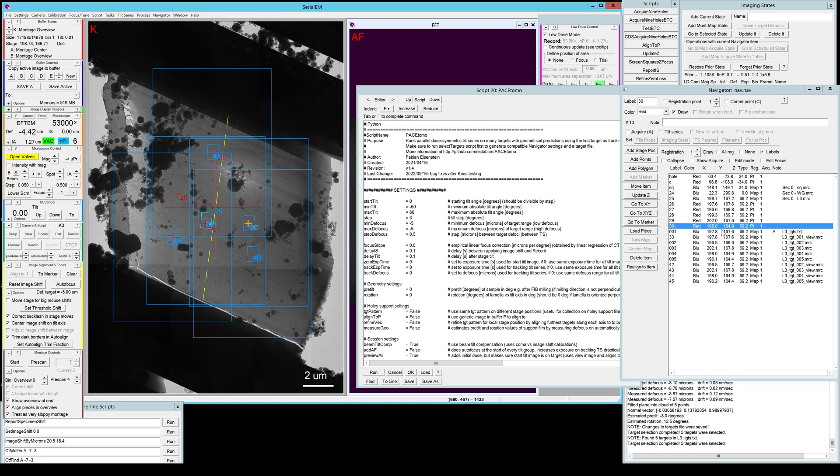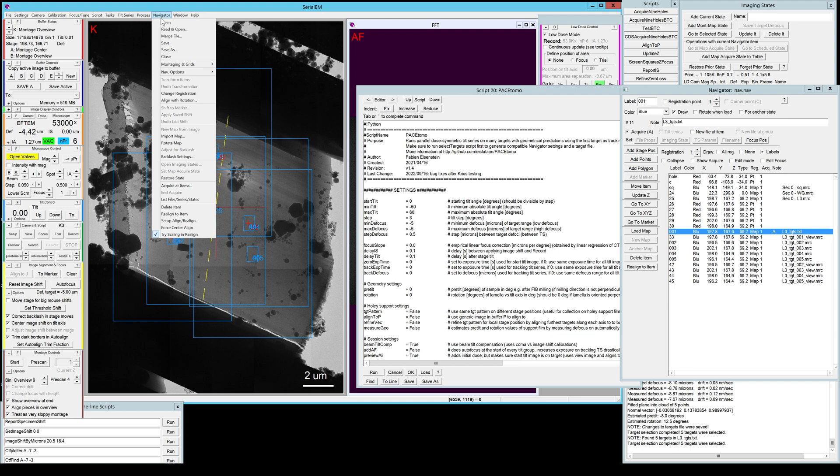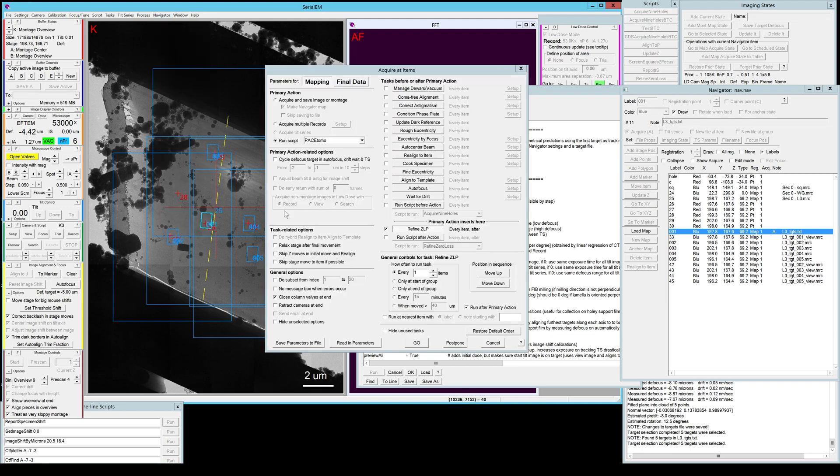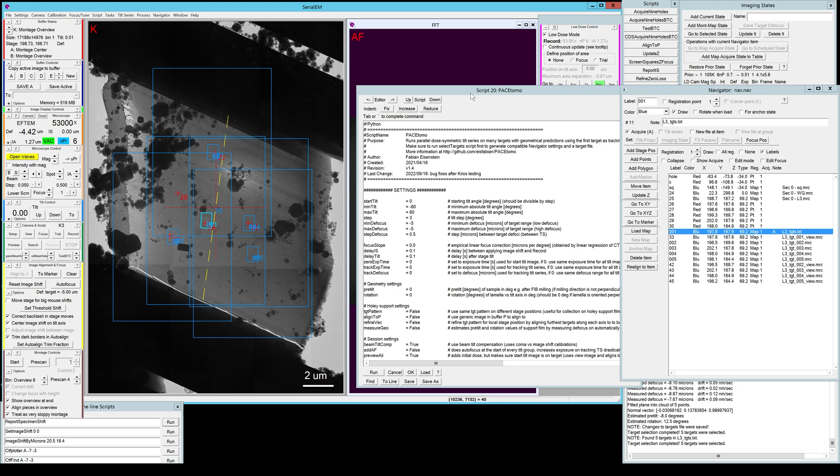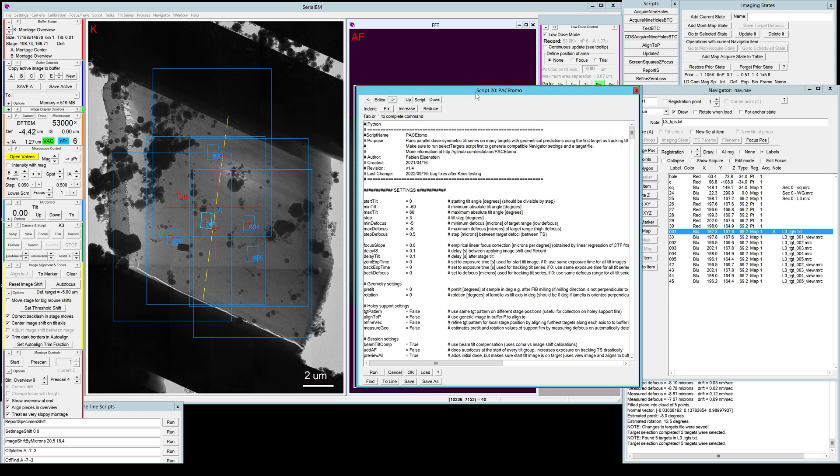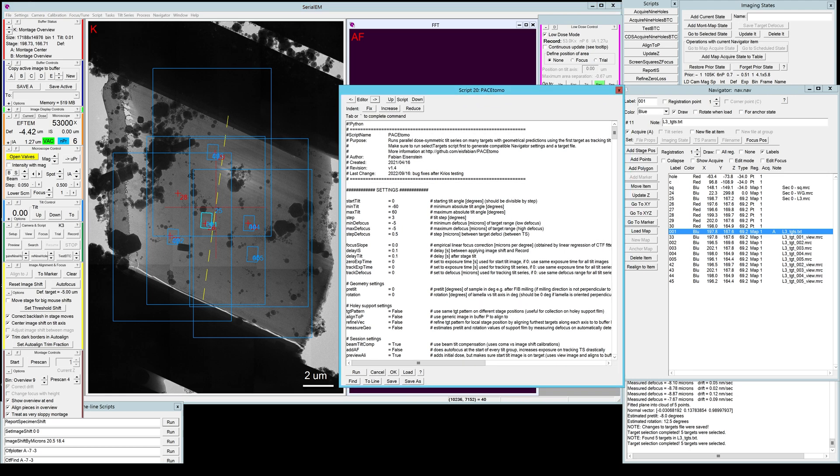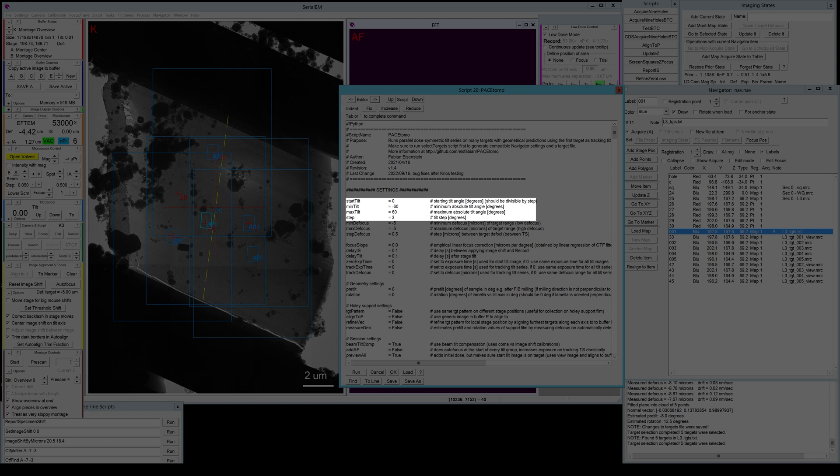So you want to select that and use that to run your script on. Alternatively, you can use the navigator and set acquired items and run your PaceTomo script and it will run on all the PaceTomo areas where for everyone only the first target has the acquisition mark. But for now, since we only have one target area, I'm just going to run the script directly. The start tilt, minimum tilt, maximum tilt are settings that are pretty self-explanatory.